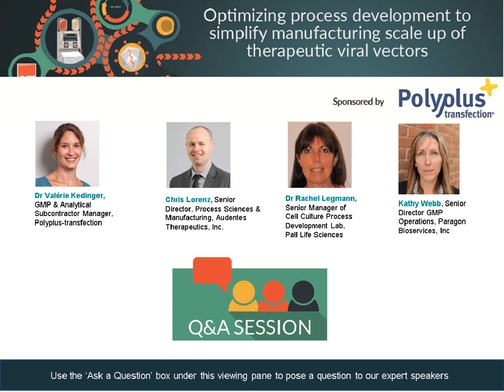I think once you start getting to the bioreactor scale, just thinking about the different mechanisms in which you're going to put your components together and how you envision that happening, reduces risk within your program. But you can replicate things at a smaller scale. You can push the boundaries sometimes to think about what some of the implications might be, especially if you have the ability to run multiple reactors. You might want to investigate some of these things at the bench scale.